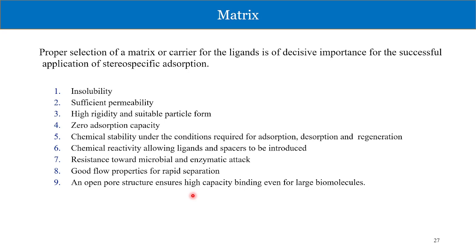Now let us talk about the matrix. What is a matrix? It is the proper selection of a matrix or carrier for the ligands. The matrix is a carrier for the ligands that is important for the successful application of stereospecific adsorption. It should be insoluble, have sufficient permeability, and have zero adsorption capacity.